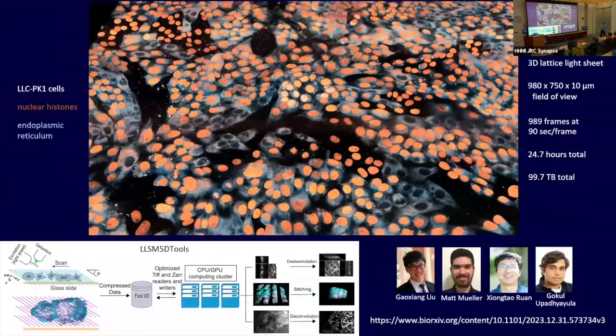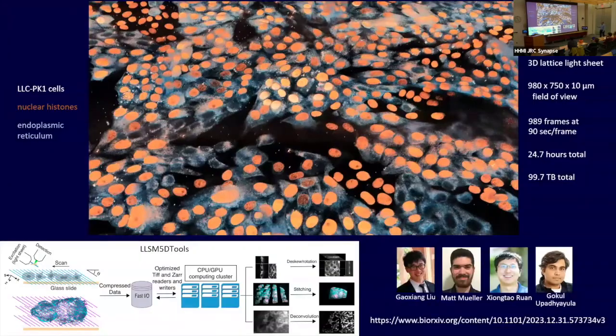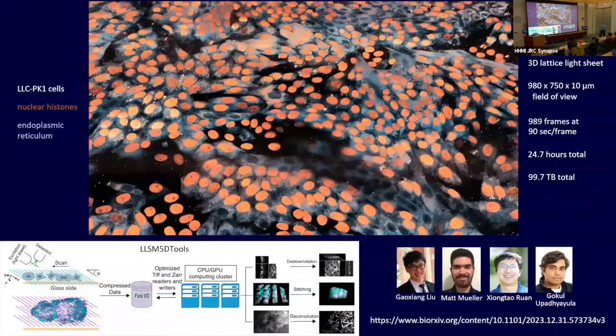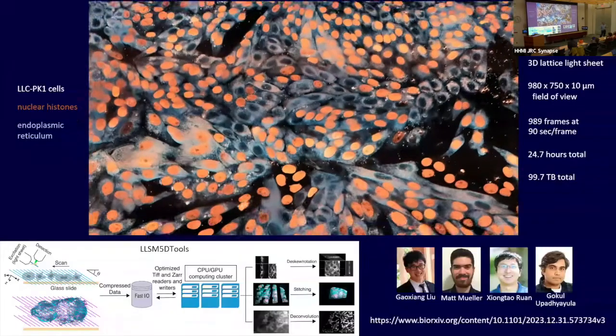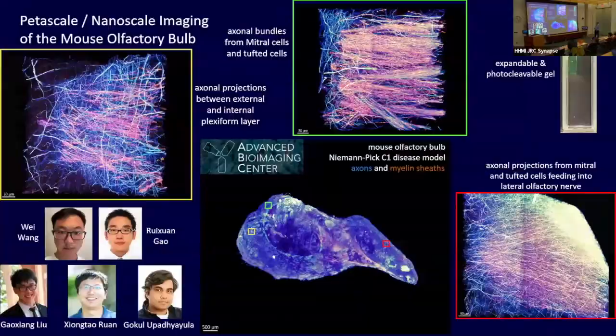And that can all be done now on about 24 cores. You can do it right at this 4 terabytes per hour. And then we compress that final result. So this took a long time, but now we have a solution that really matches the speed of the microscope to do all of that. But that's just that first part.